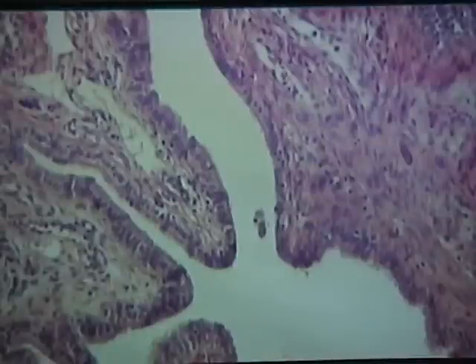Let's go to our next type of epithelial tissue. This is our next type of epithelial tissue. This tissue is called simple ciliated columnar epithelial tissue, and it's found in the fallopian tubes. Now, the epithelial tissue is right here. Free surface is here. Bound surface is here. This is the part of the lumen of the fallopian tube. So our epithelial tissue runs along here, forming the lining, and we know that epithelial tissues form linings and coverings, forming the lining of the fallopian tube.